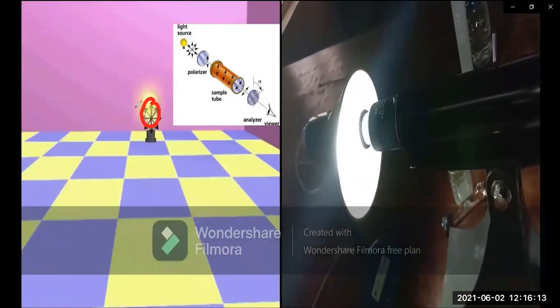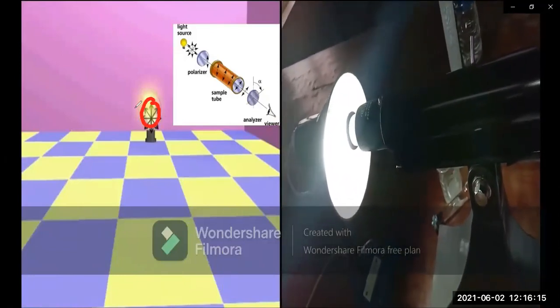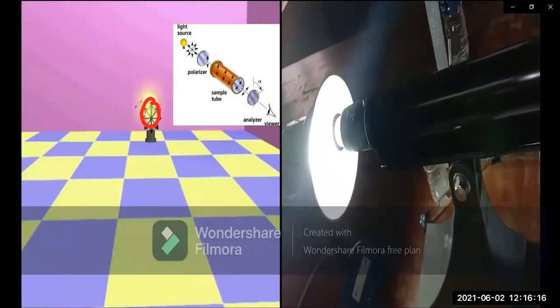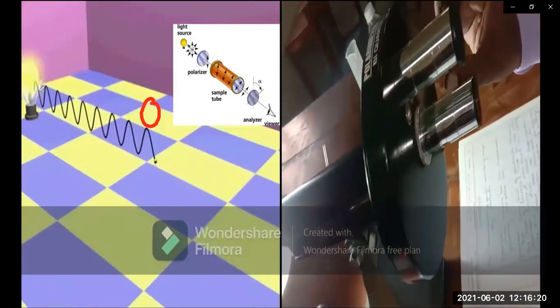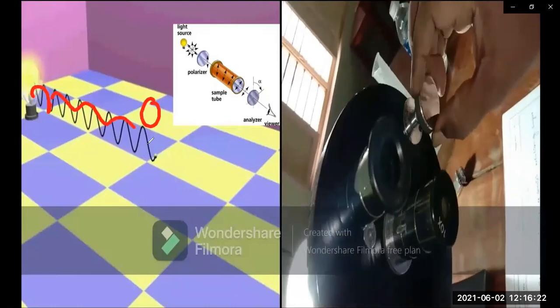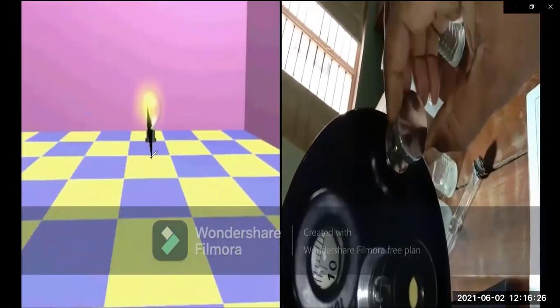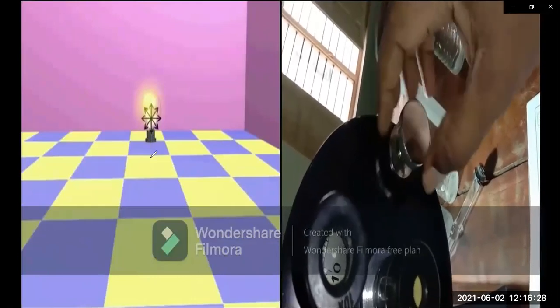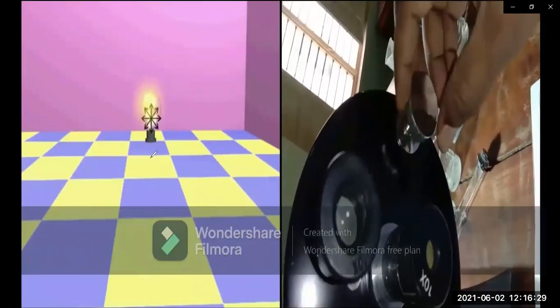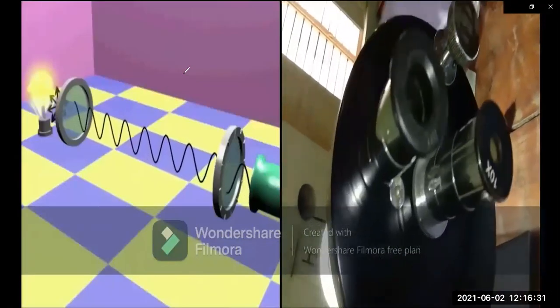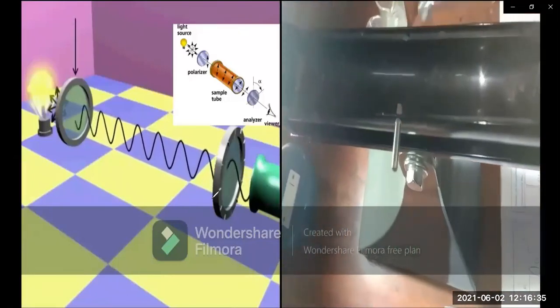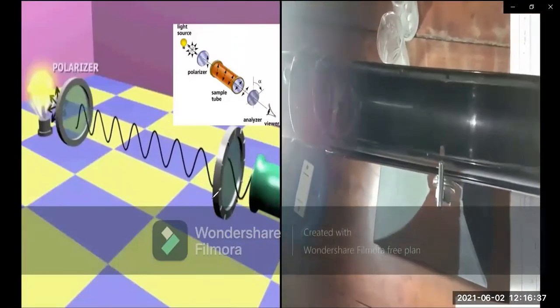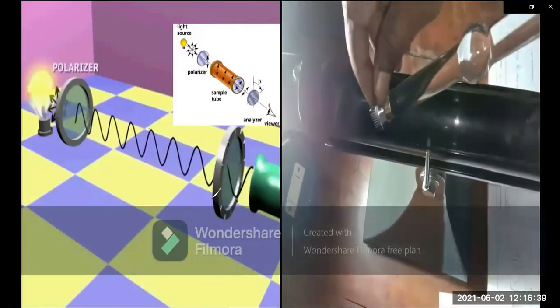This is a light — just a bulb. This is a monochromatic light. This is a polychromatic light, and this is the actual light. The active planning uses the monochromatic light.